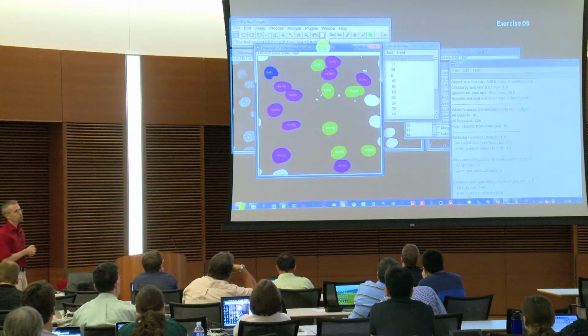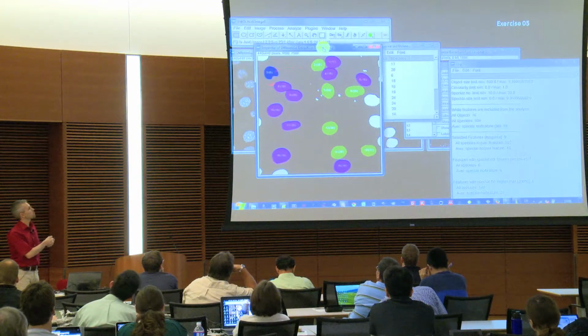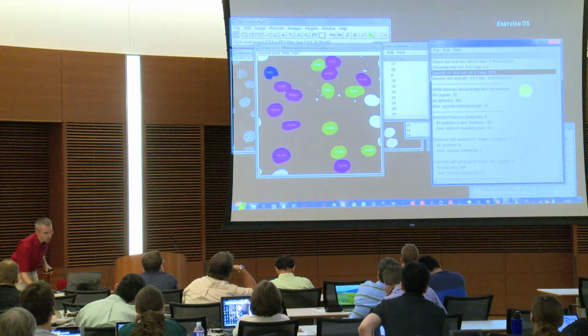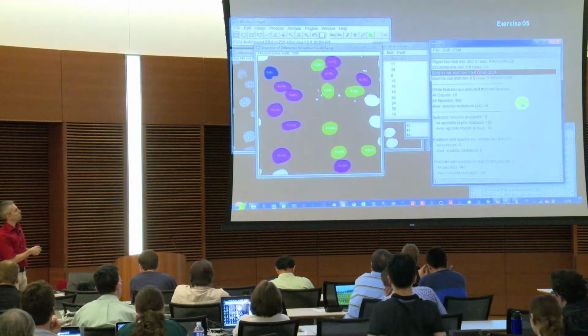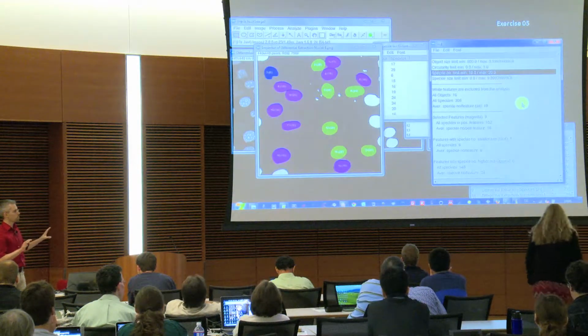Now you have green and blue. Why? Because the blue means this has fewer particles than my 10, which I keyed in. So here are my parameter settings. I said speckle numbers, if there are less than 10, indicate that, and more than 20, and the green ones have more than 20. So this is visually separated.